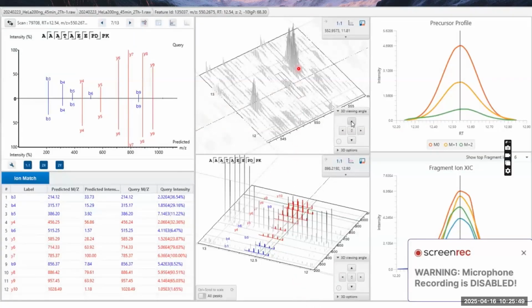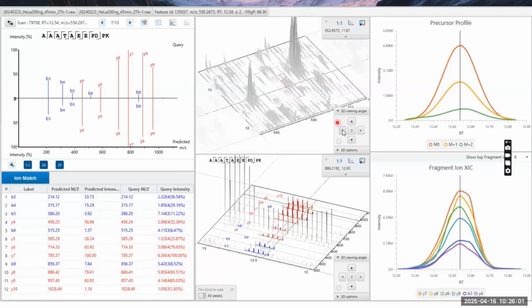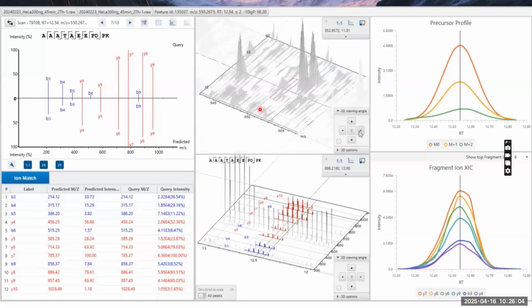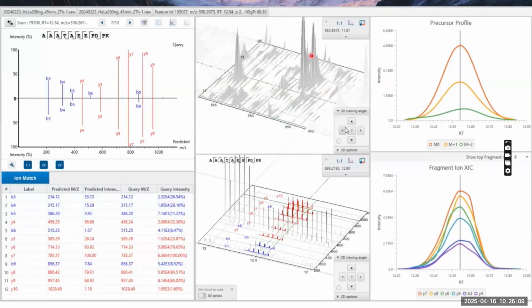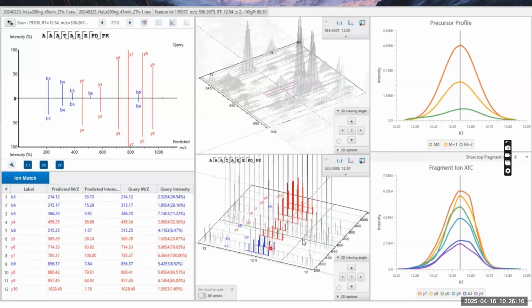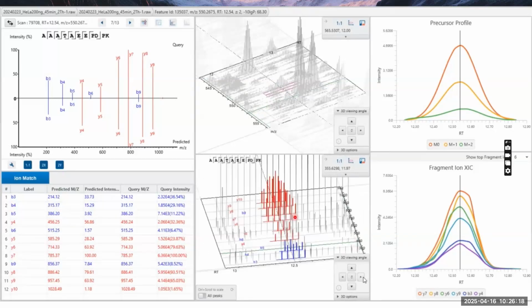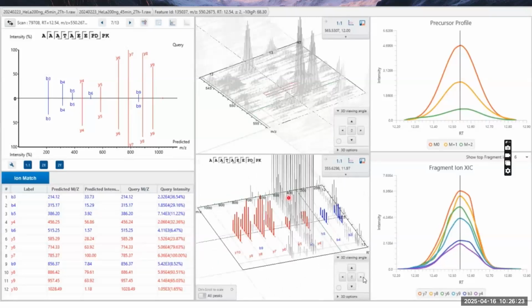So here this is the measurement peak for this peptide. So let me start my video. So here we'll give you the 3D view. You can adjust to use a different angle to see, okay, this peptide. This is the other peptide background. You can see, okay, since they have the shape here, so it's good. More importantly, is at the MS2 level. You can see here with colors, it's the fragment ions for this peptide, and you have so many background ions here.